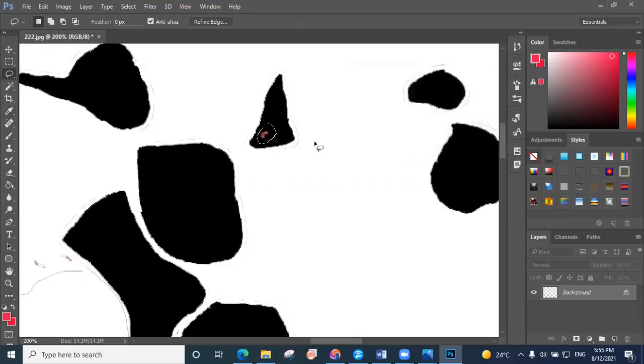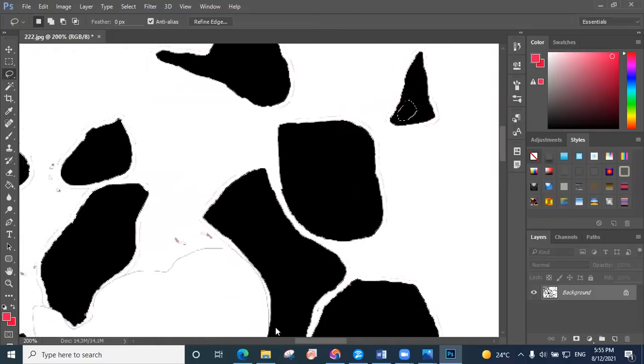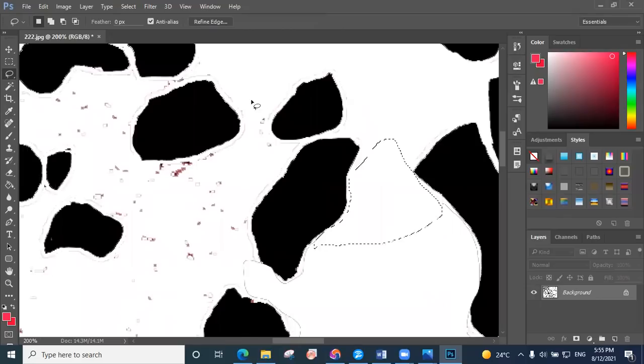Make sure when you determine the grains, you change the color. When you clean, change to a white color.